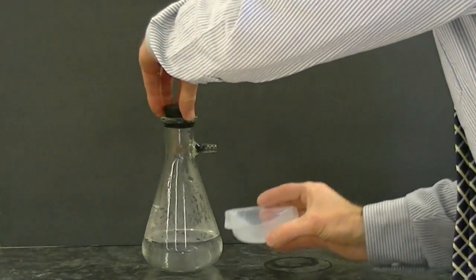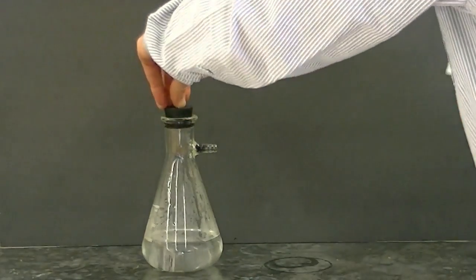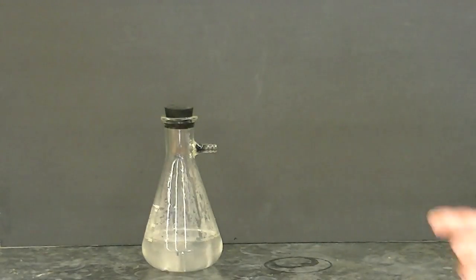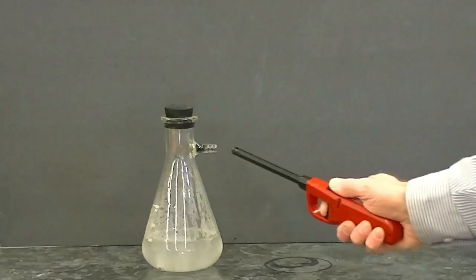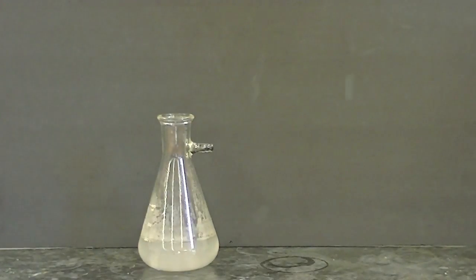And then I'll place the calcium carbide into the water, which will make some acetylene gas. And then we'll try to ignite the acetylene gas that's forming through this small opening in the flask right here. Wow, that was a pretty big bang!